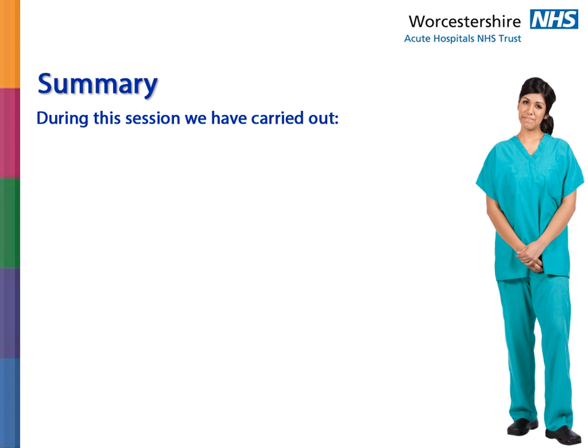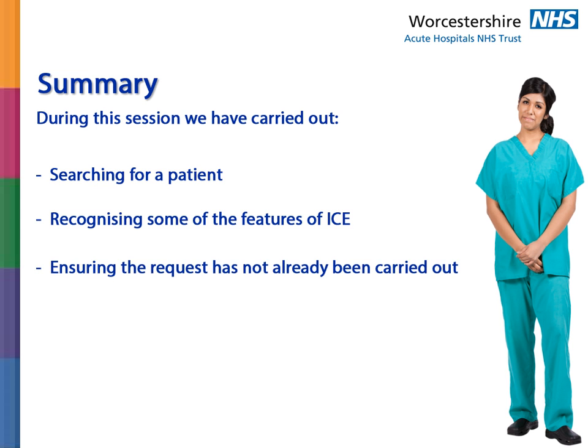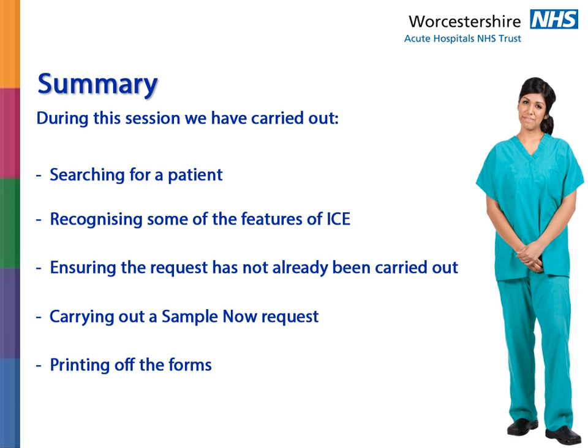During this session we have carried out searching for a patient, recognizing some of the features of ICE, ensuring the request has not already been carried out, carrying out a Sample Now request, and printing off the forms.